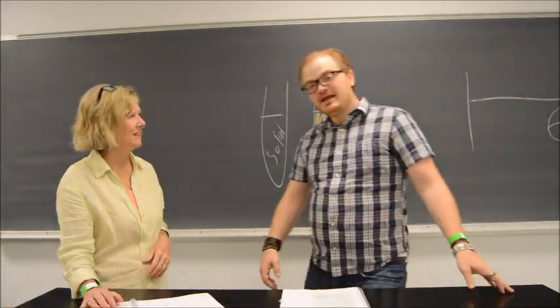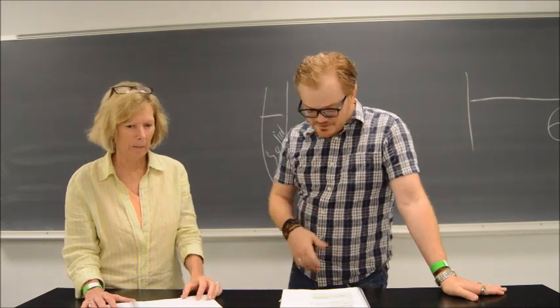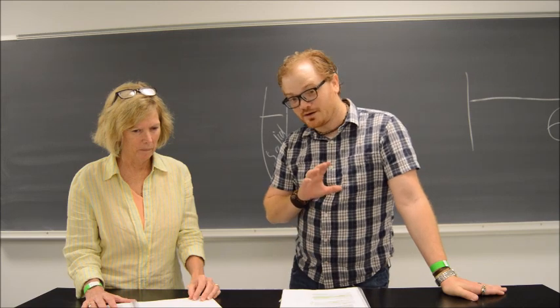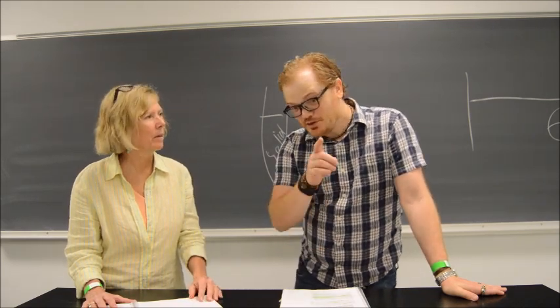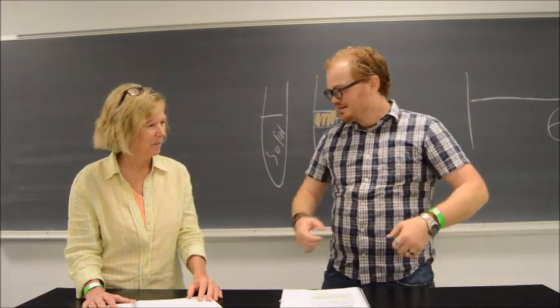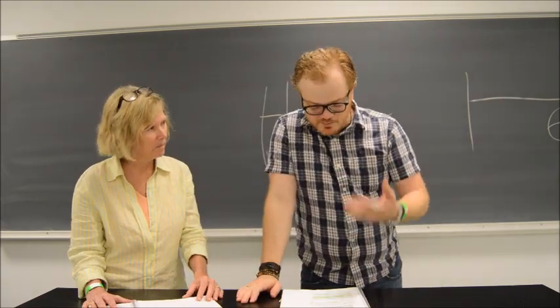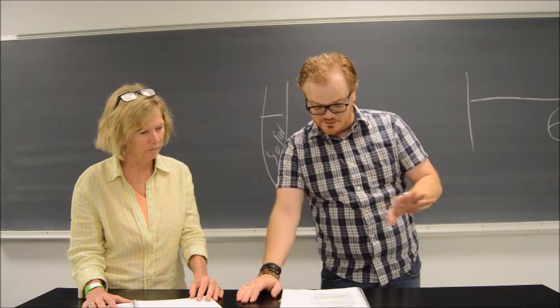All right, perfect. All right, so the third part of this little experimentation today is going to be on proteins. Now, what you need to consider here before we go any further is that you are quite familiar with the concept of a protein and what a protein is. When you see someone, your hair, your nails, your skin, your musculature, I mean, it's protein. Exactly. Okay, it's protein. So having experimentation that gives us the capacity to determine the presence of these proteins is incredibly important.